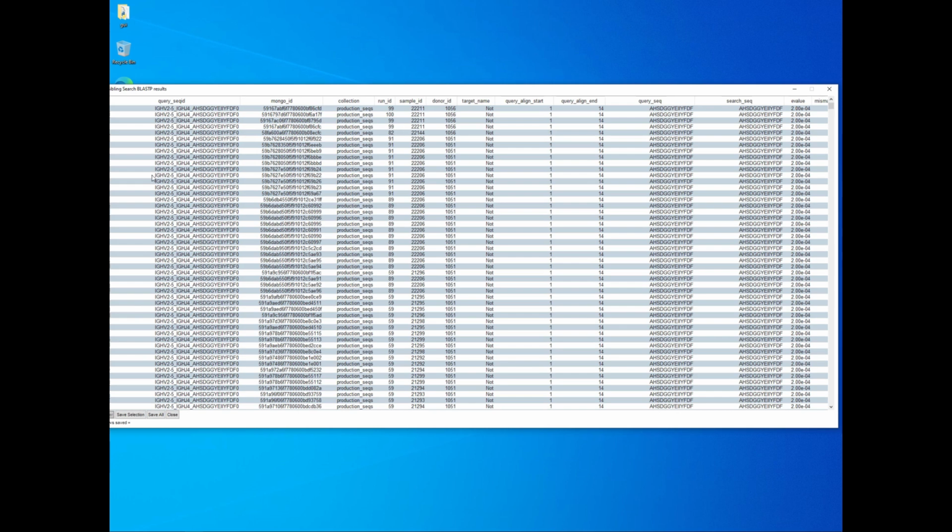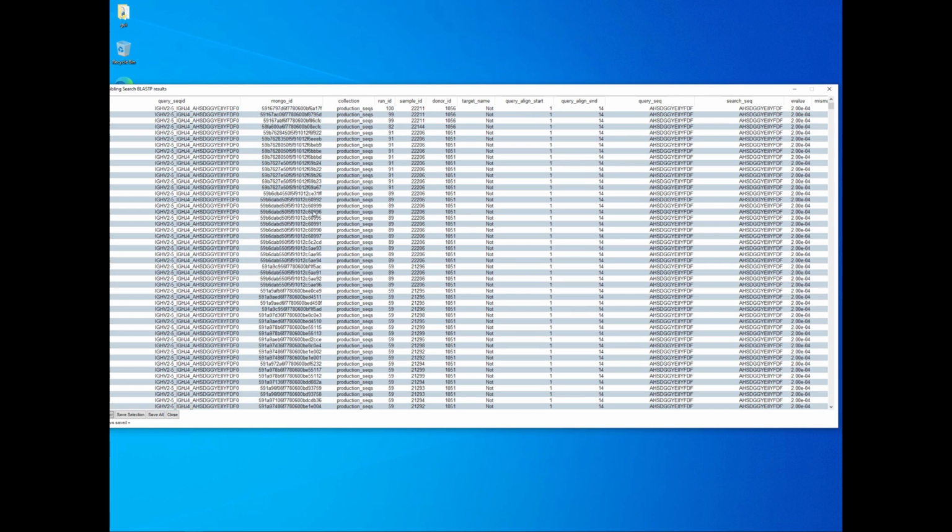that pair of V germline, J germline, and CDR3 length to see how many sequences fall within a lineage that your sibling or your similar sequence belongs to. But that's all really open-ended and up to you, and it depends on the kind of project that you're working on.